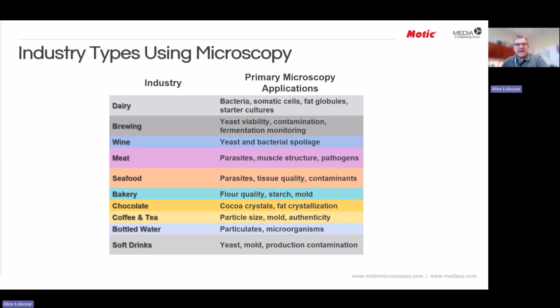Just to give you an idea, if we're out searching, hunting for different industries that would benefit from microscopy applications, we won't get into each of the applications here. We're happy to share the PowerPoint with you should you want to get a copy of it. Just let us know at the end.